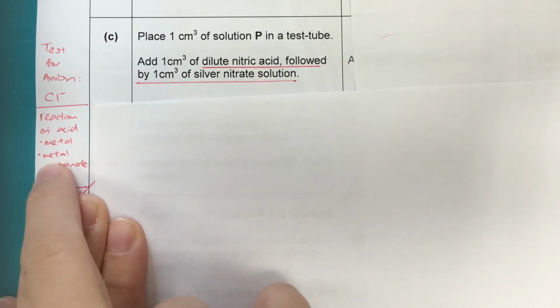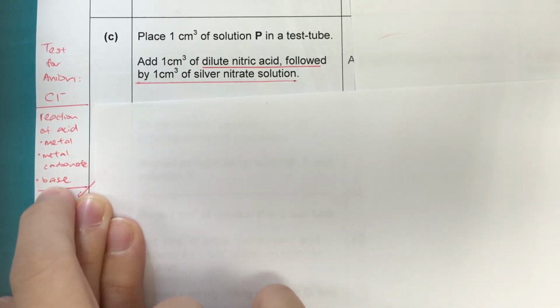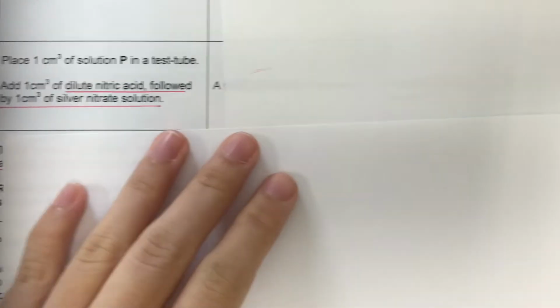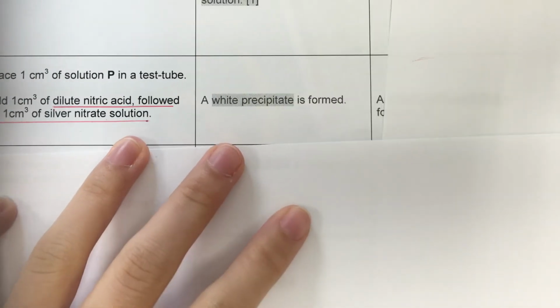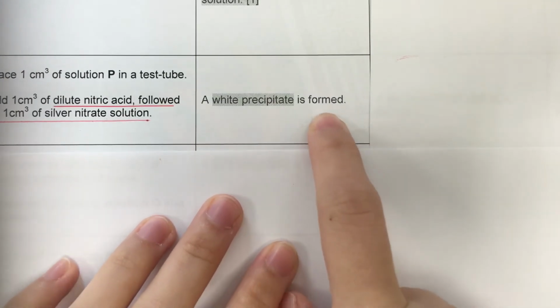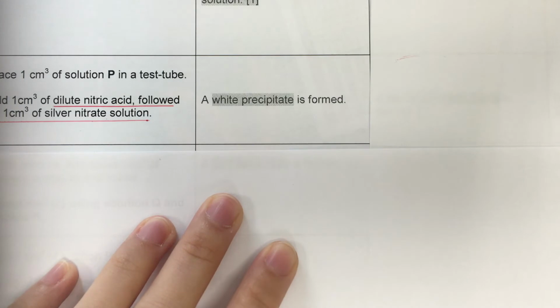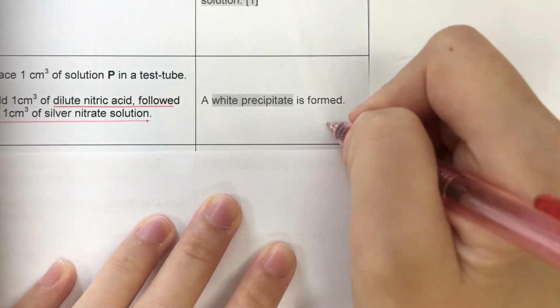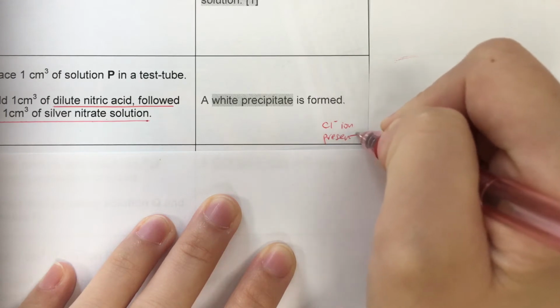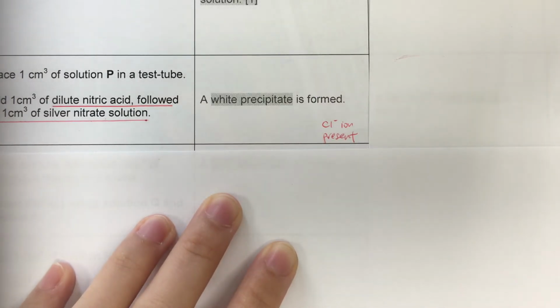okay, the next thing before P is that if you add acid, there could also be a reaction of acid with metal or metal carbonate, which means there could be effervescence. So here a white precipitate is formed. That's it. So with this, likely it means that chloride ion could be present. So now we have identified the anion in P.